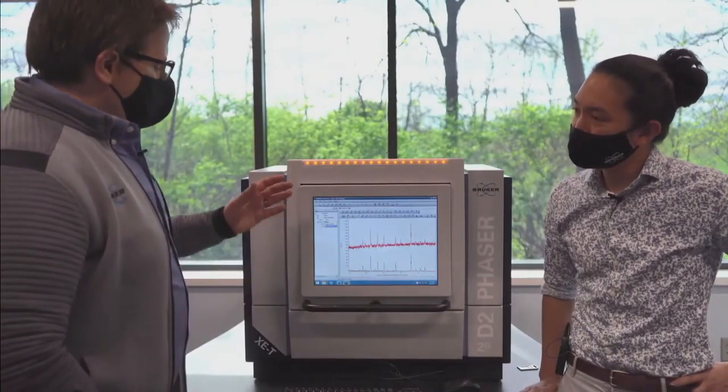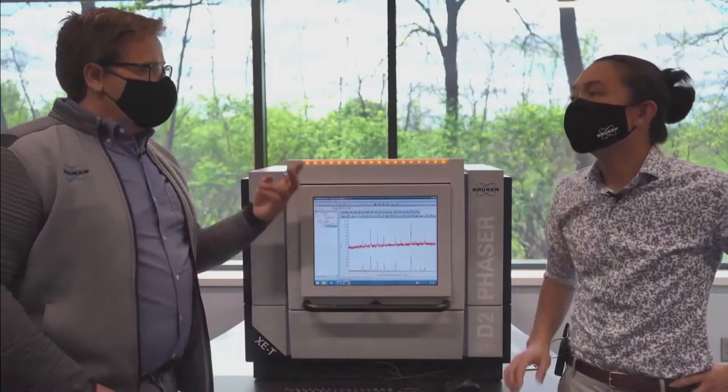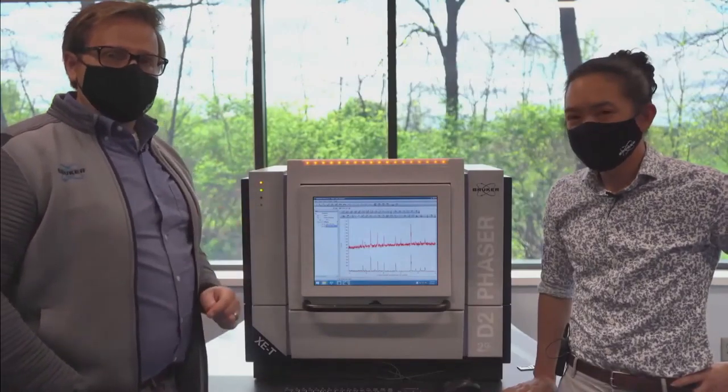That's right. So thanks for demonstrating this. Yeah, of course. We saw not only the K beta effects, but also the sample background effects. What we're going to do is head back up to the studio and answer the questions you sent in live. All right. See you there.